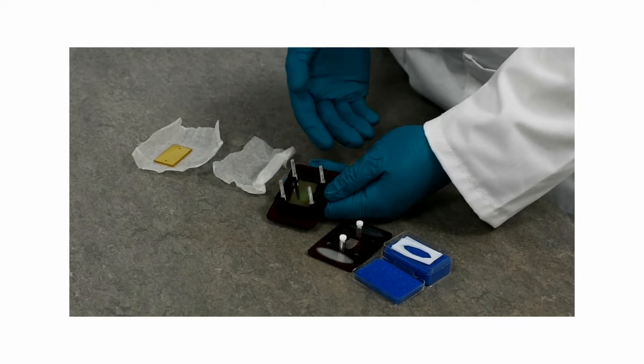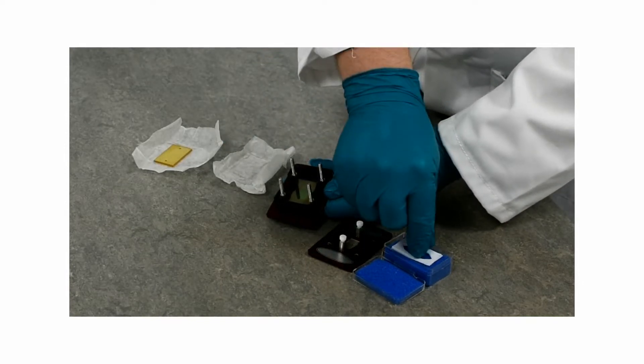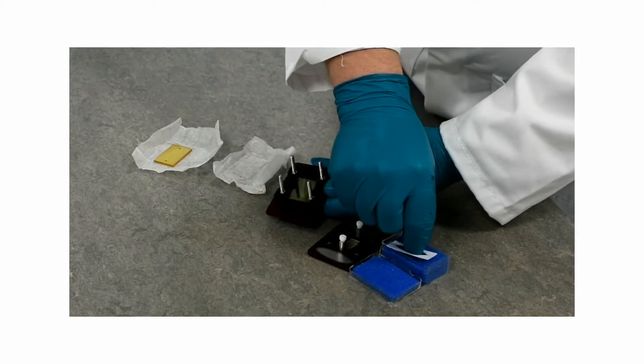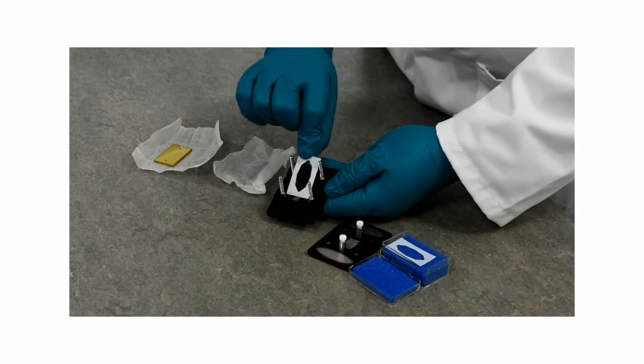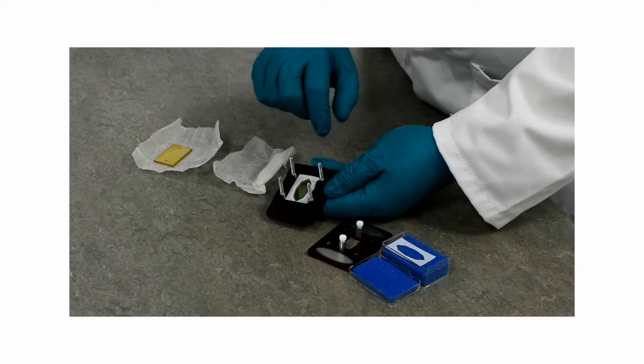You then want to insert a spacer. In this case we're using a PTFE half a millimeter thick spacer, and you just insert it into the cell.